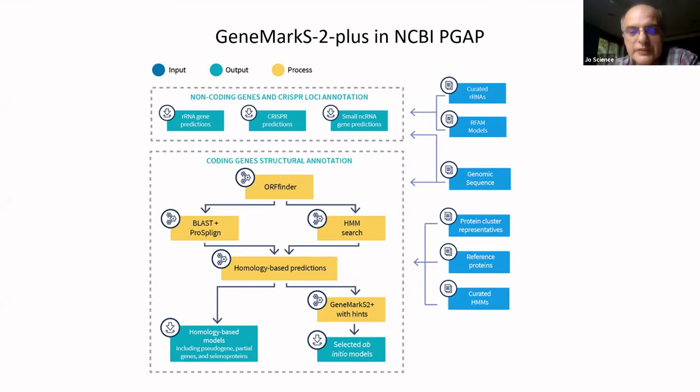Please run a program, get a prediction, and everything is done by machine learning behind the web interface. But sometimes we can do a little bit better. We can improve the prediction by taking additional information into the software, and by this improve the gene prediction.